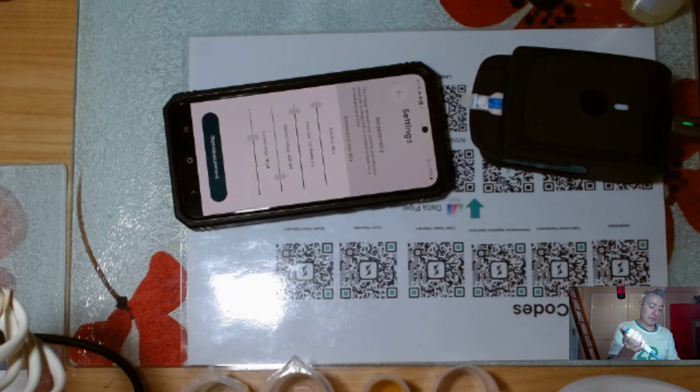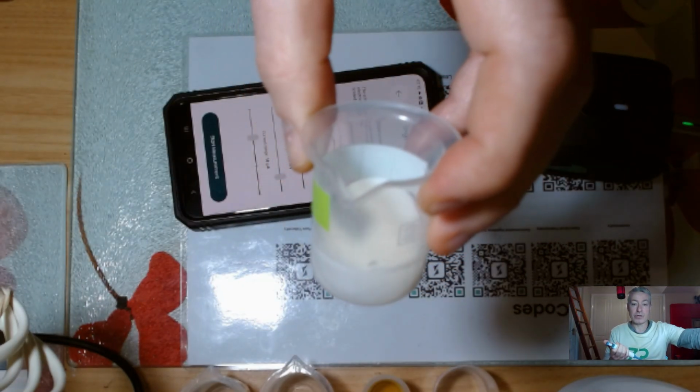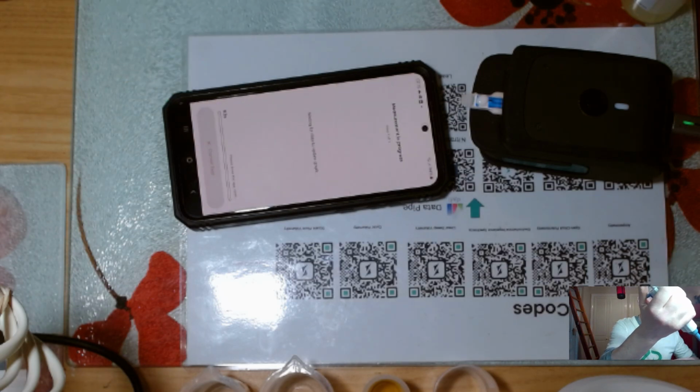The electrochemistry, by the way, this person's also interested in optical as well. The problem with optical systems, and ZP does have an optical system, is the sample has to be transparent. There's something fundamental about many real-world samples: they are not transparent. If you want to make a low-cost, easy-to-use assay with very little sample prep, hey, no sample prep, I've just put the milk on there, it's probably electrochemistry, actually. Right, so we go start.